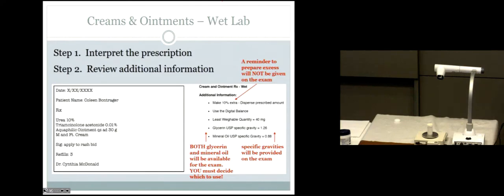All right? So what do you need to know about this? A couple things. Fact that urea is a solid. It is a powder out there. So that's easy to deal with. You just weigh out whatever you need. But I'm telling you, it's very different than the hydrocortisone that I used up here was. And I chose urea specifically because it's very granular. It's almost like salt in terms of being kind of a granule, okay? Even if you levigate it with that particle size, I will see big old spots everywhere because it's a large particle size powder.